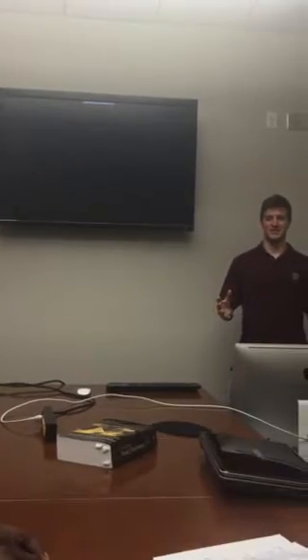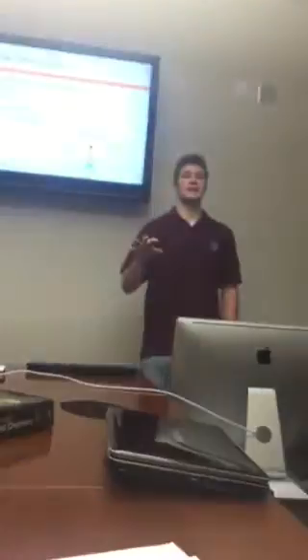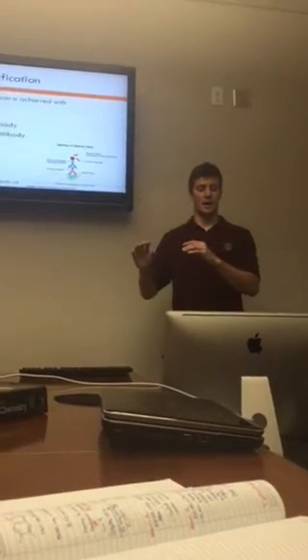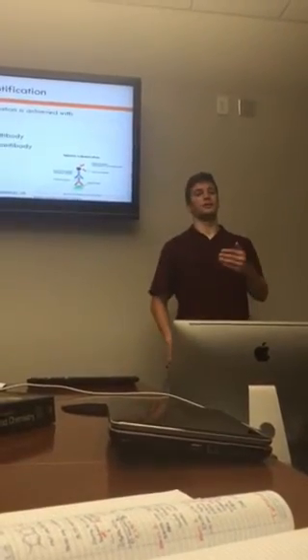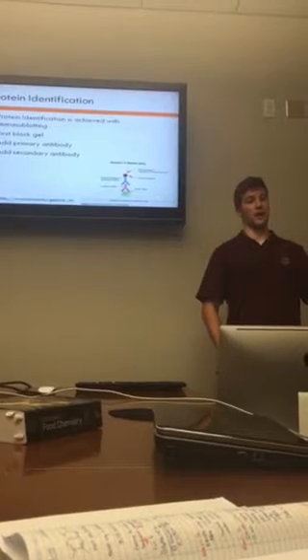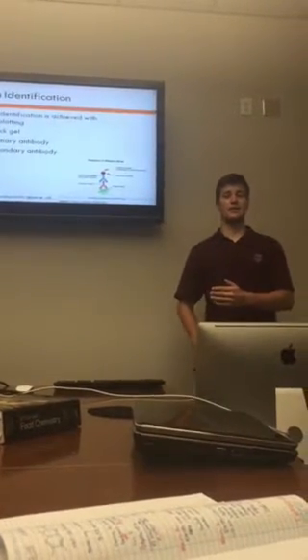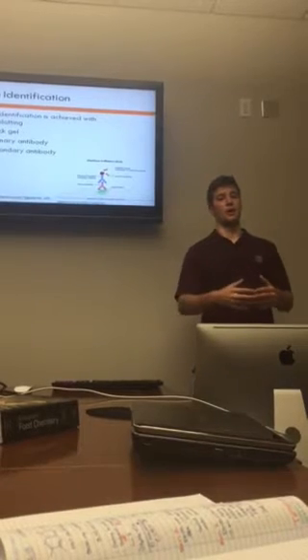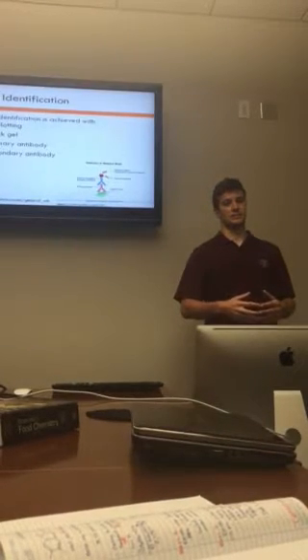Does anybody have any questions? Yes. So when you did your Western blot, how does the first antibody know to bind to the second antibody? Generally you have a species-specific primary antibody. So your primary antibody might be derived from rabbit, and then your secondary antibody would come from another organism, like maybe goat, and it would respond to all rabbit antibodies.